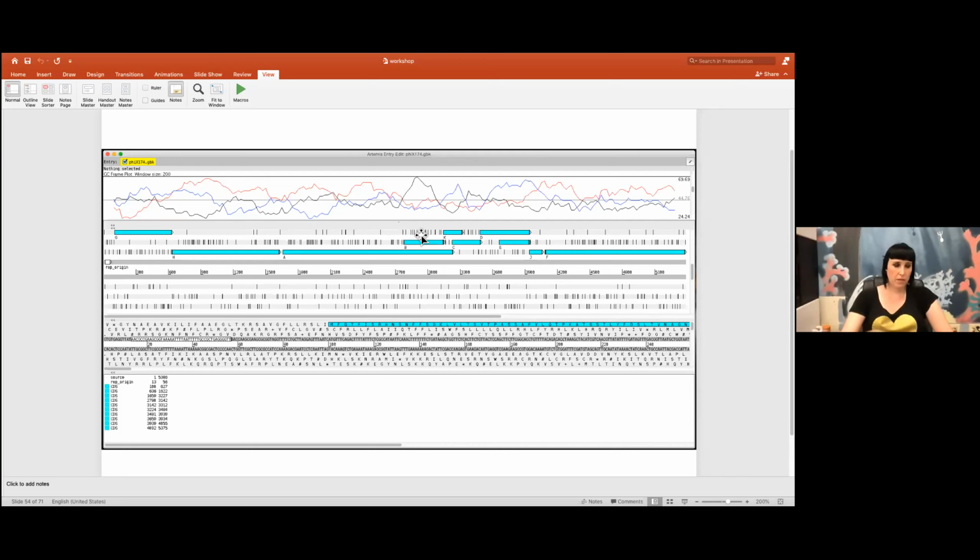I'm working on making that available for PHANOTATE, but it's really troublesome because there's just so much potential for adding false positives to the data. So a lot of this is that you have to use an automated program to annotate a genome, and then you have to go back in and fill it out yourself. This is something I've always been doing, and I kind of just realized that I have to do myself. And I've actually found other labs that have the same kind of procedure, that they have automated steps that they annotate, and they have their students go through and manually curate the genes by adding in any missing genes or removing any false positives.